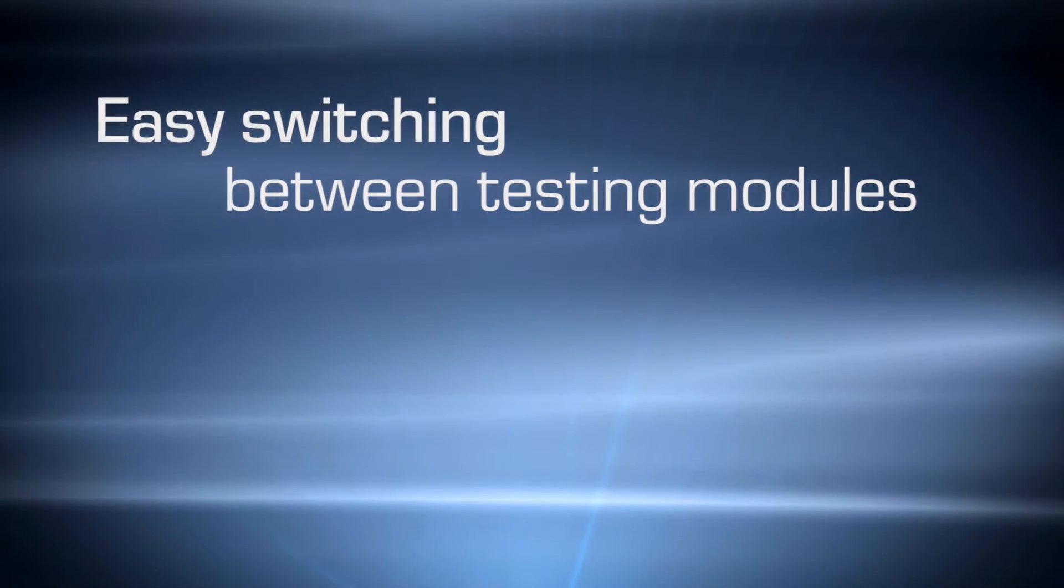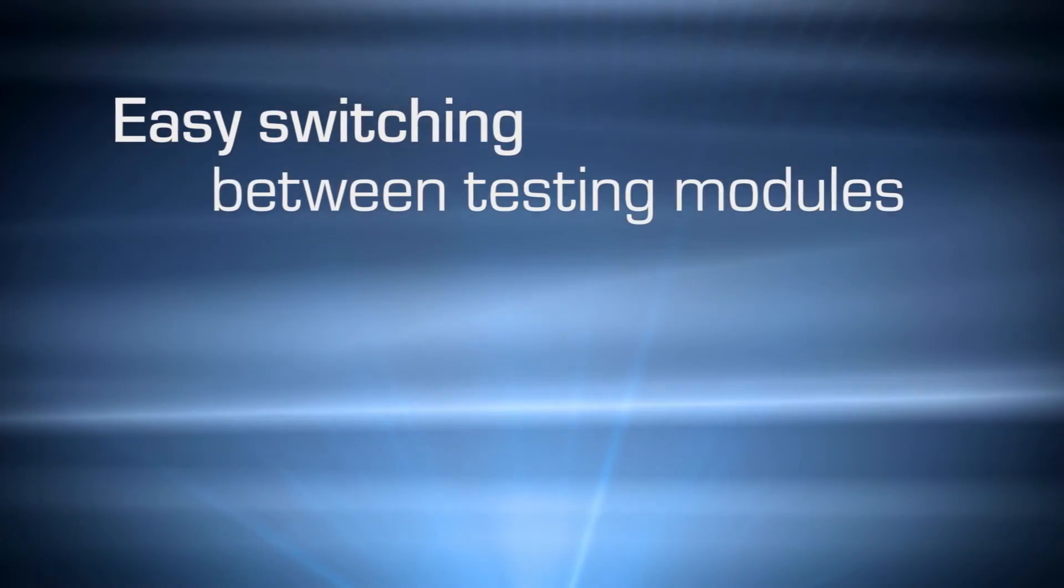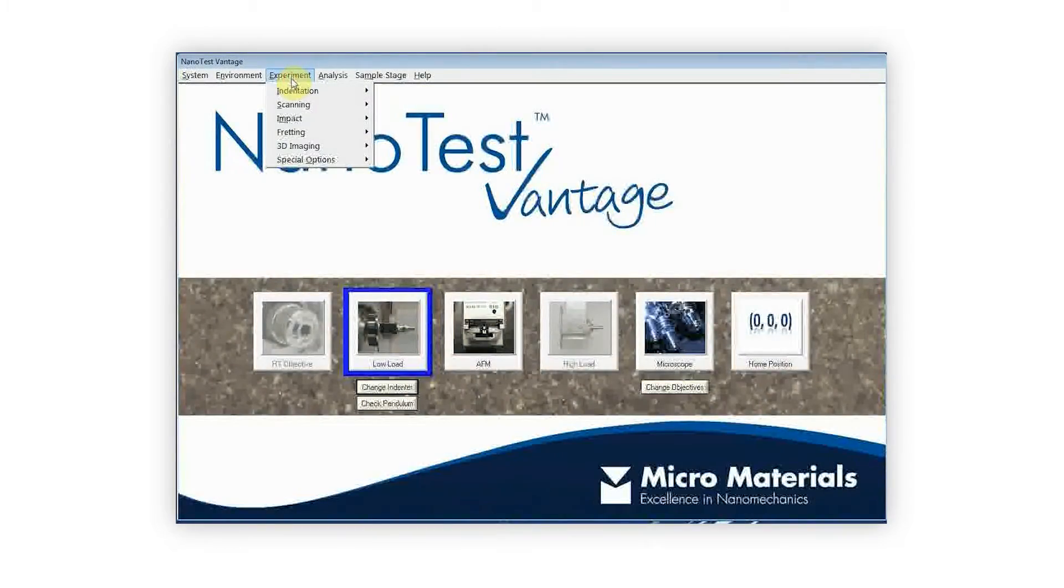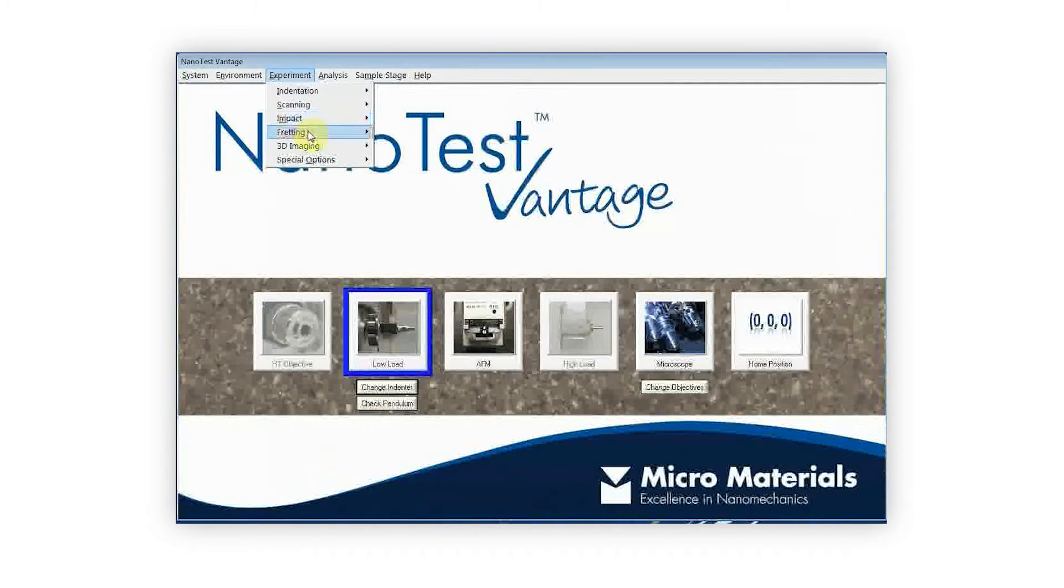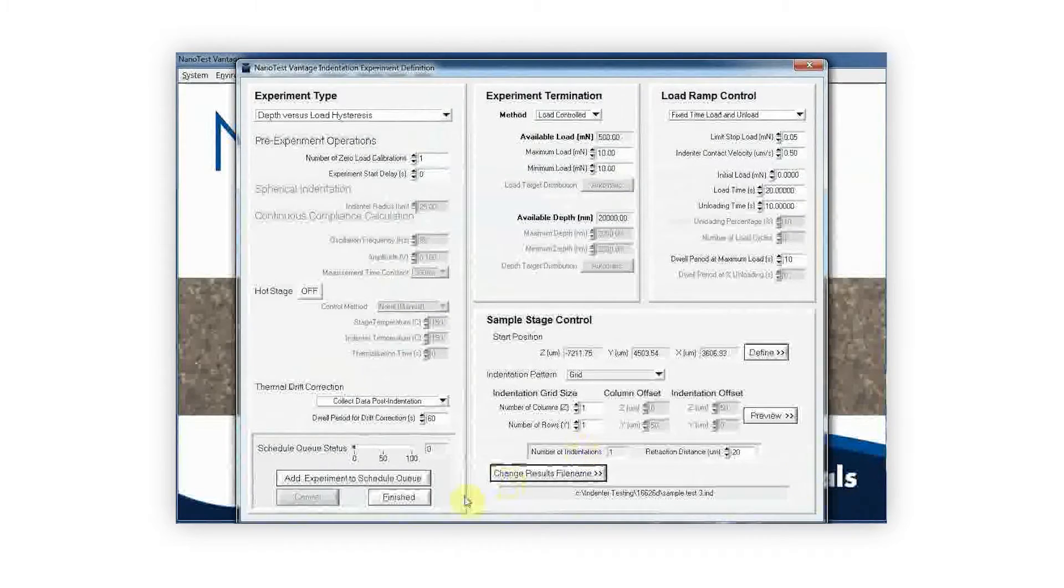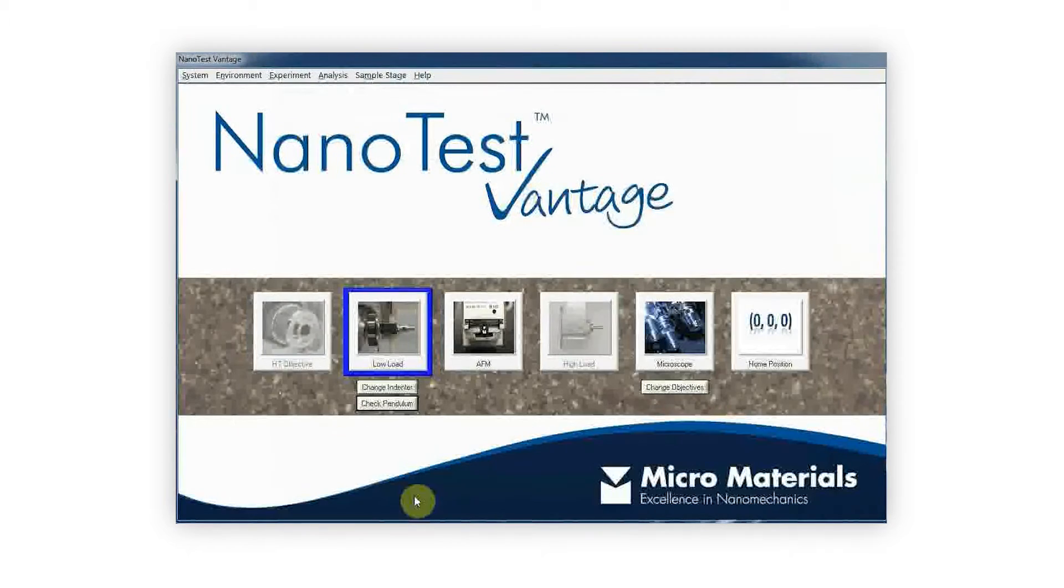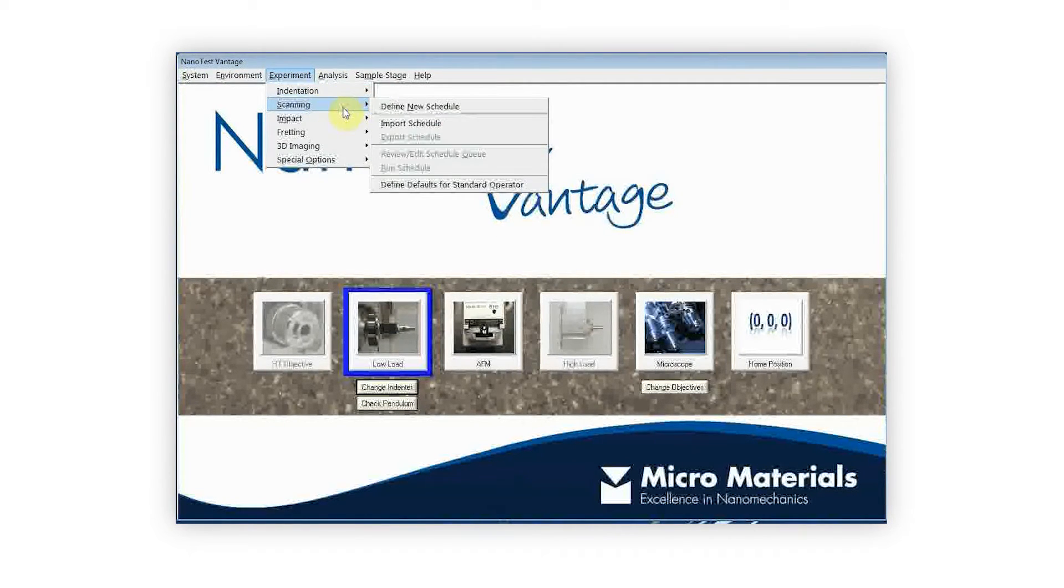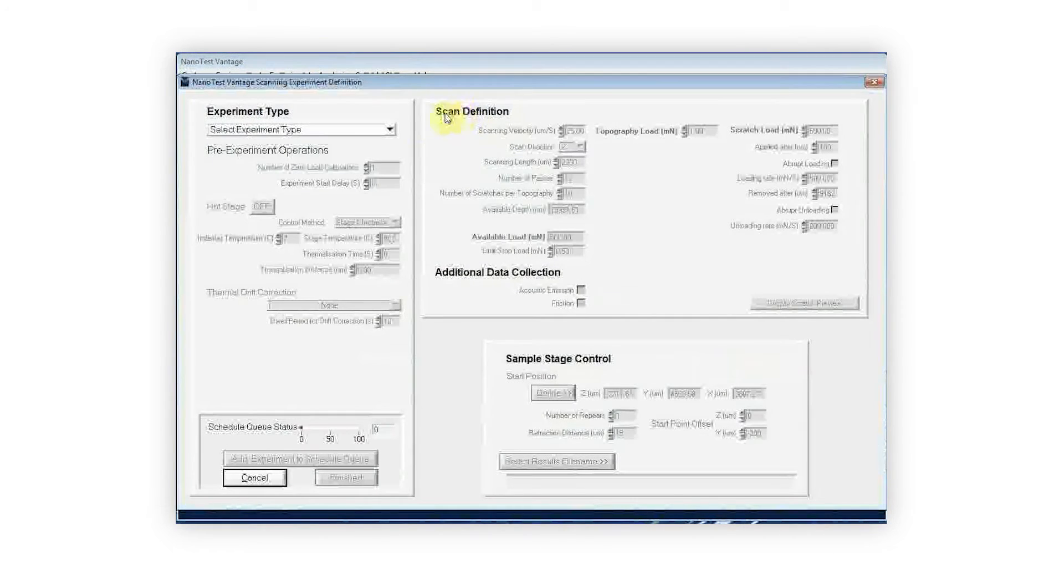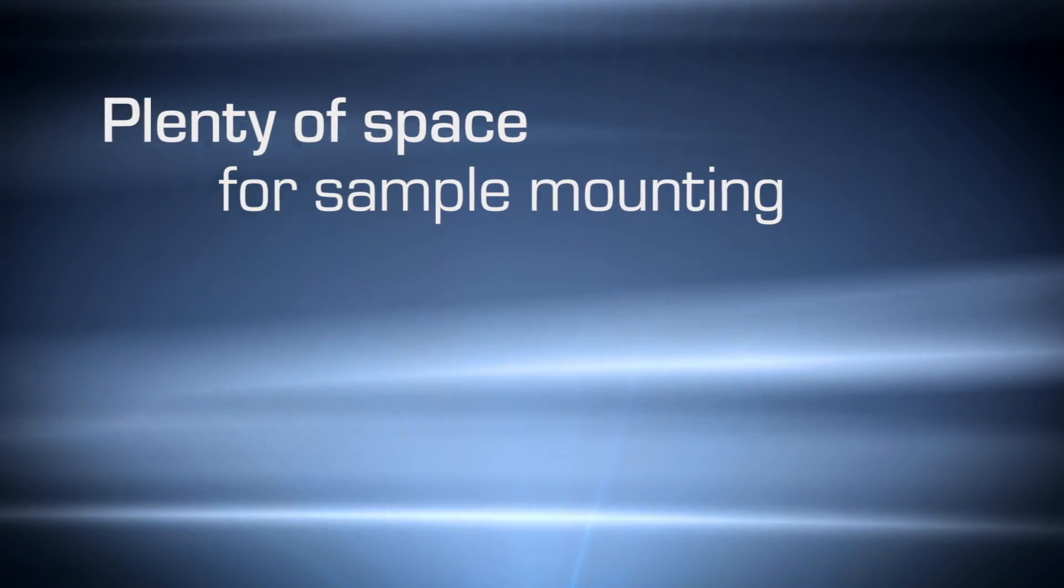The NanoTest systems offer the widest range of nano- and micro-mechanical test techniques, from nano-impact and nano-fretting to micro-scratch and micro-indentation. This multifunctionality is complemented by the simplicity of switching between these testing modes. For example, changing from indentation to scratch testing just means selecting a different experiment type in the software.